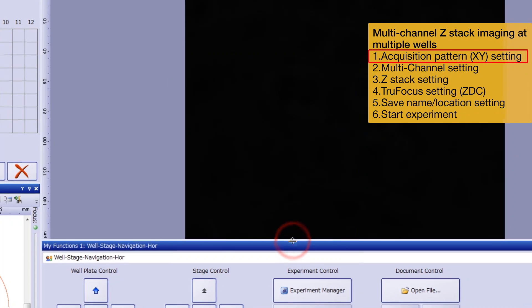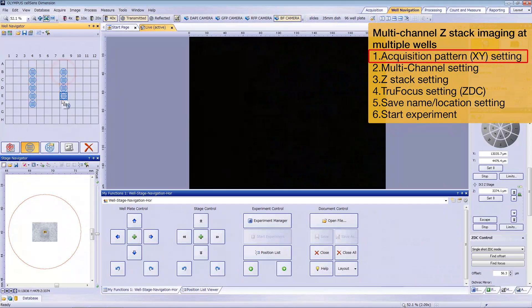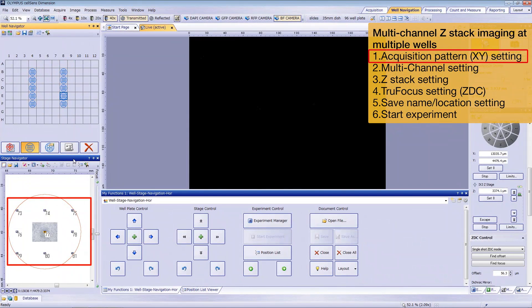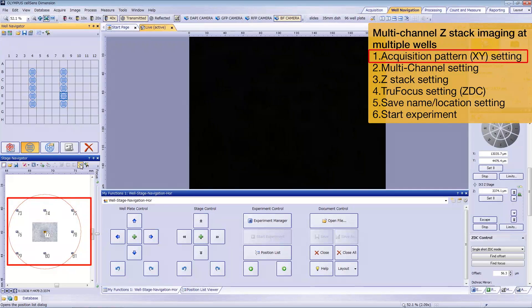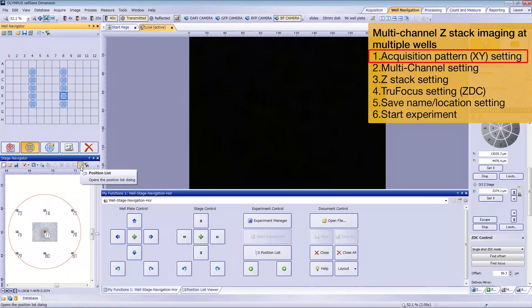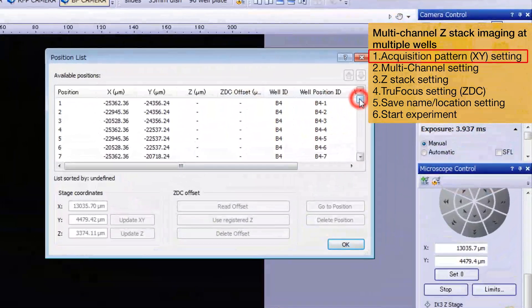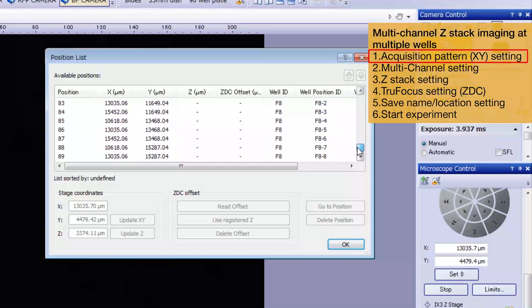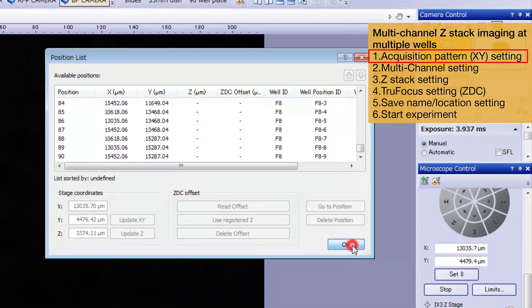To copy this pattern to multiple wells, left-click your mouse and move it across each well. The pattern is clearly visible in the preview window: three columns, three rows with spread spacing. Click the position list to check the registered positions. The XY position, Well ID, and Well Position ID are registered at each point. We'll define the Z position later. Click OK to close the position list.